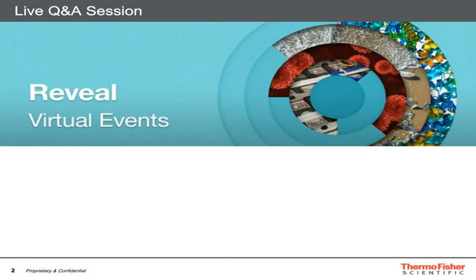Going to the next question. This one is about Raman: is there any database available for Raman analysis? Yeah, absolutely. This is Matthew speaking. The OMNIC spectroscopy workstation that is used to run the Raman components can be loaded with several libraries from the factory. We have available materials characterization libraries, which are very relevant for this topic. We also have condensed phase, organics, polymers, and many other types. You also have the ability to add and curate your own spectra to libraries for use during the course of your investigations.